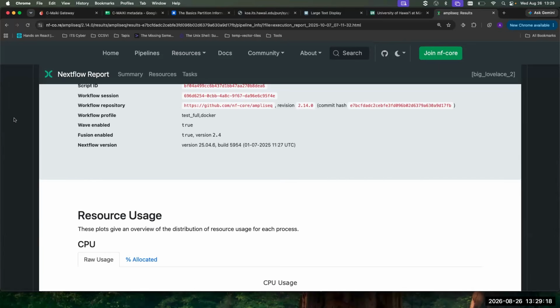The short answer is, the ideal way, what Maggie's hoping, is that you can run the pipeline 6 different ways, and it will basically tell you, oh look, you get the most reads out, or the most quality reads out, or the most things classified if you trim, say, a 300 base pair read to 210 instead of 220. And the short answer is yes, run the pipeline 6 different ways and compare the outputs. But no, there's no automated, 'for your sequencing run, the best parameters are this.'